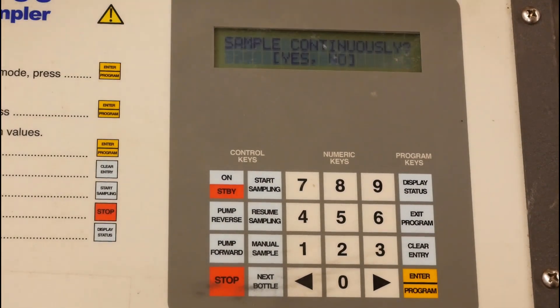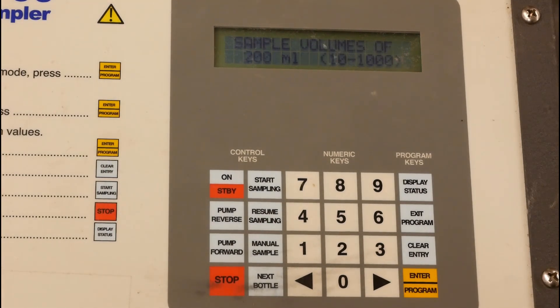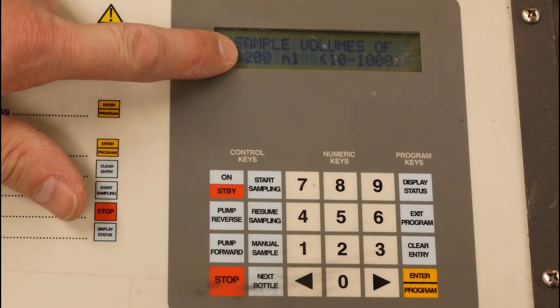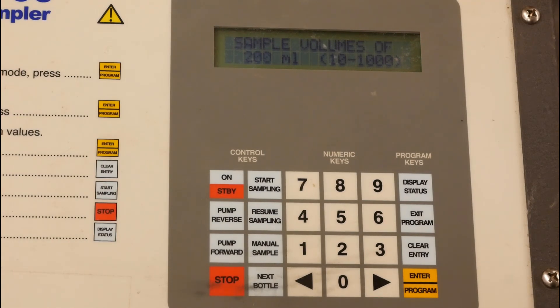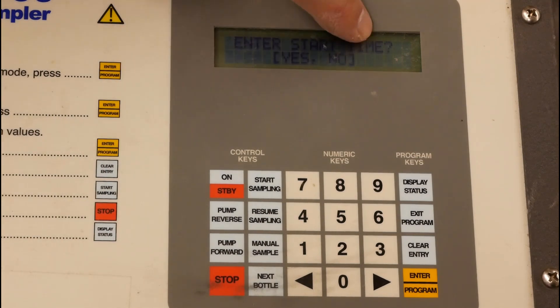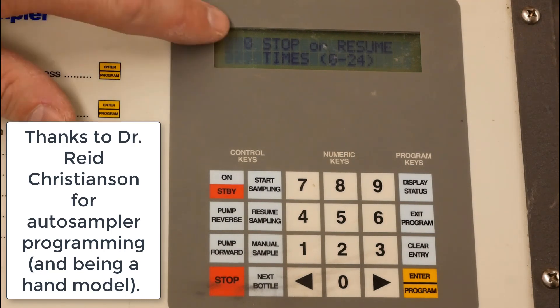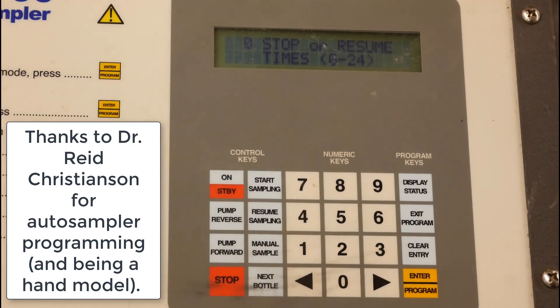Sample continuously is set to no, meaning it won't go past bottle one and start refilling after all the bottles are collected. We'll sample 200 milliliters per sample. For the start time, we're not entering a delay — we just want it to start right away. Zero stops or zero resumes — we're just going to start it and it's going to go.